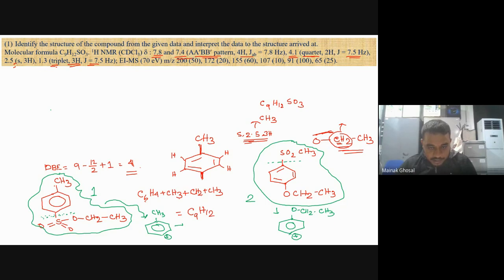This one is C7H7 plus. Generally toluene, if it is present, I will come into that, generally gives a peak of 91, but this is not toluene. This is something else, which I will talk about after this question. So you see there is a peak at 91.